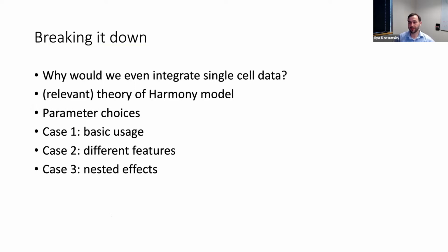Okay, so this is an outline of where I want to communicate today. First, I want to talk about this problem because I think it's a tricky problem, and I want to motivate why we want to use it and what we want to get out of this integration of single cell data sets. Next, I want to explain just some parts of the math and theory behind the Harmony model, and hopefully understanding a little bit of that math and theory will help you when you actually use Harmony in practice in your data integration use cases. It'll motivate your use of certain parameter choices as you run Harmony. And then once we go through that overview, I'll go through 3 cases from standard to some non-standard uses of Harmony and integration.